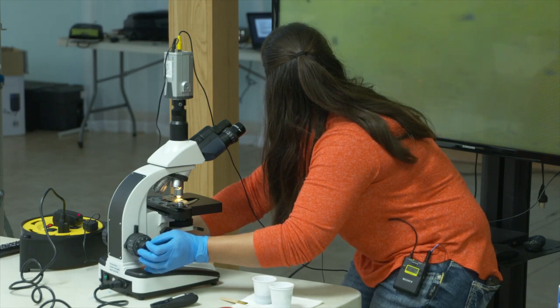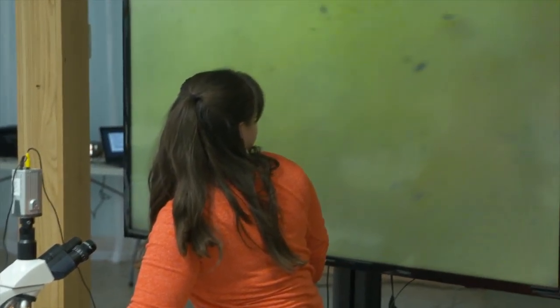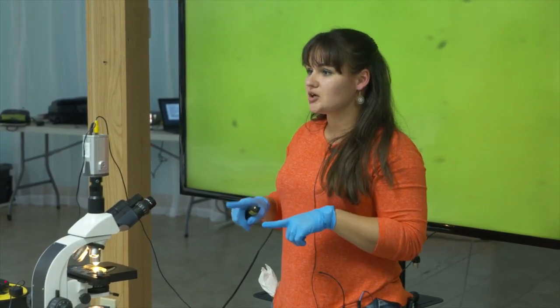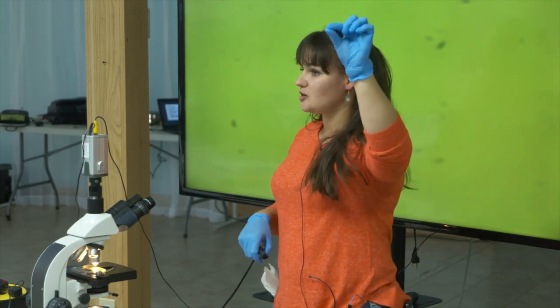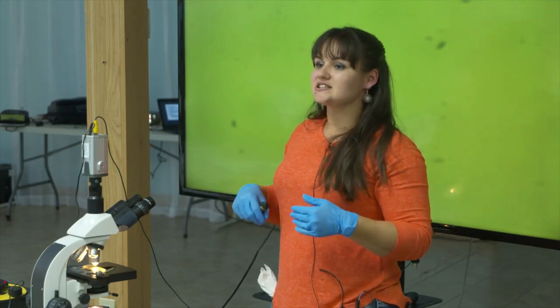These were samples we took out of our lab that we did for the sheep and goat barn at OSU. When we first did it there were several parasites in it. There are going to be two chambers full of fluid; each of those two chambers has a blue square with six columns in it. We're going to be consistent — start at the top, go down, over, back up. Whether you count the left one first and right one second doesn't matter, as long as you do it every time.